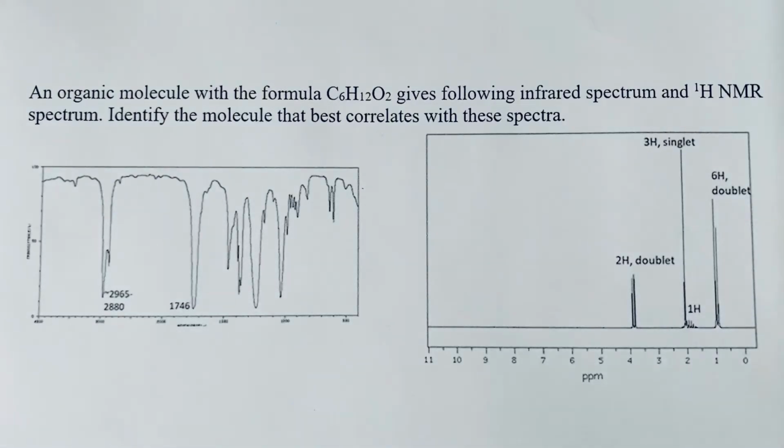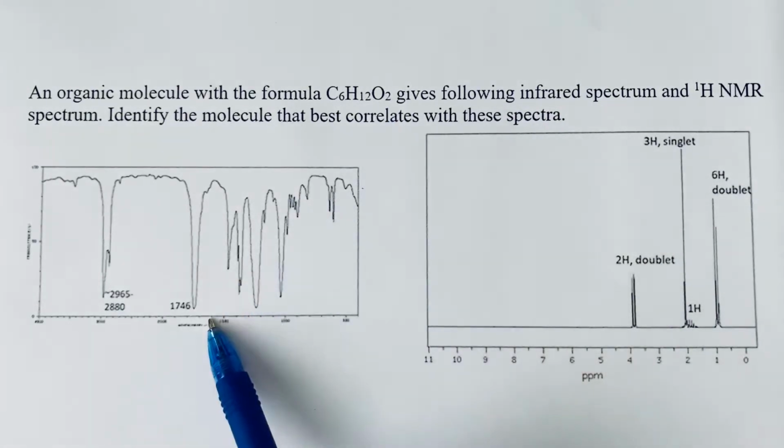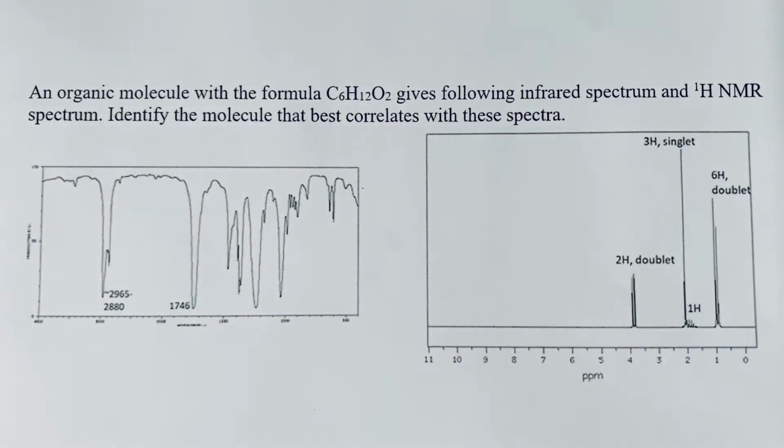from. And I accidentally cut those off this slide, so we solved it without the options, and we can do that again here now. We have enough information with the formula and the infrared and the proton spectrum to propose a structure that is consistent with all of this data.